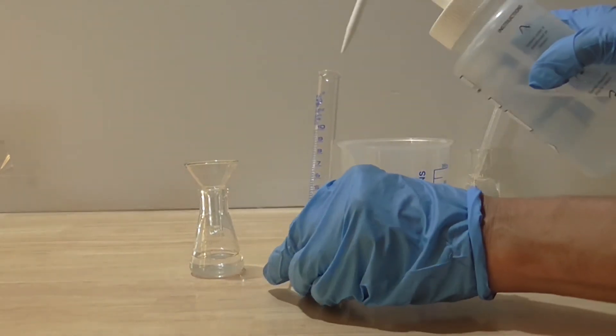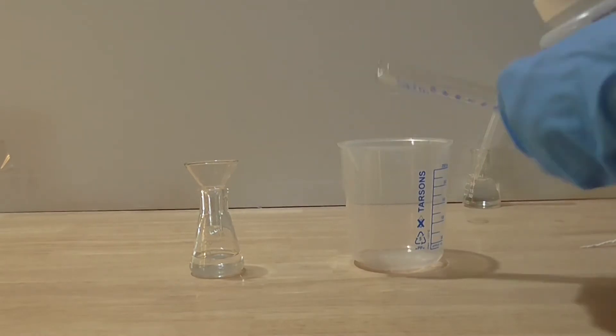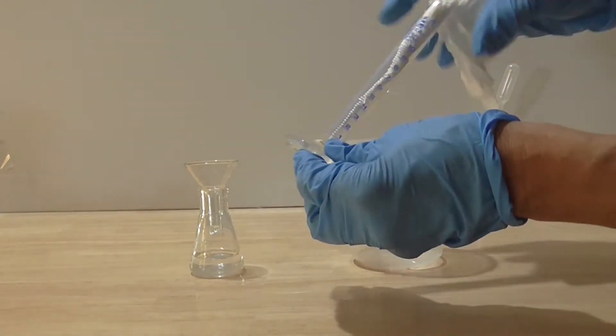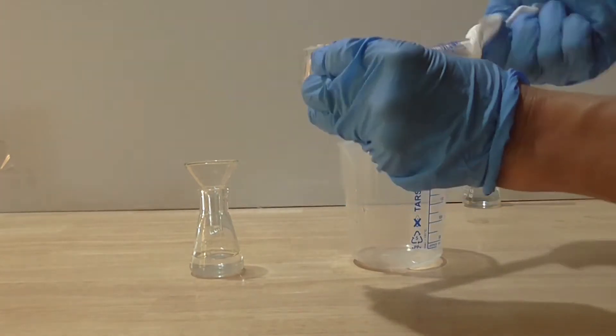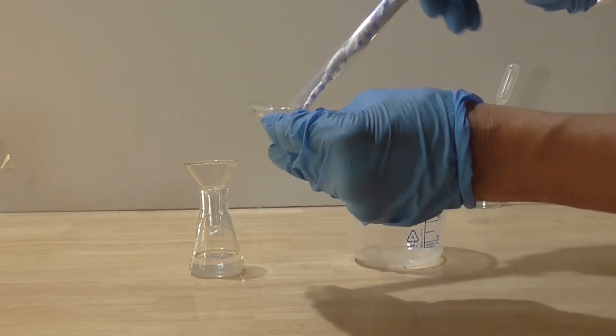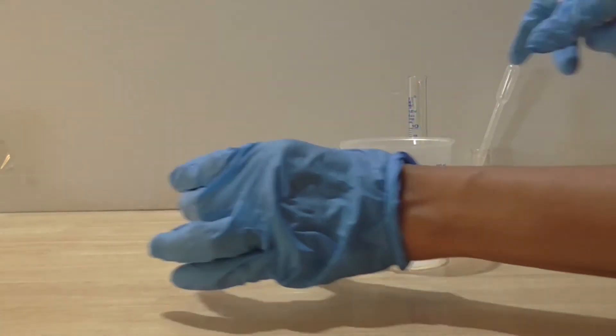I am now ready to make my next acid. However, you must first wash and dry the measuring cylinder and glass funnel. Use distilled water to clean these and discard the water into a waste container. Dry the glass vessels with tissue.